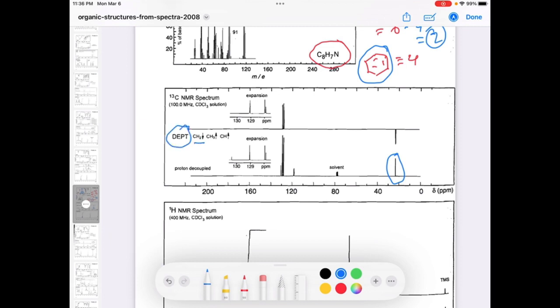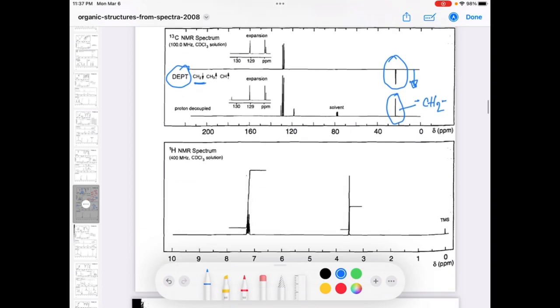In the DEPT, if you see, look at the DEPT. We always know the DEPT always gives you the CH2 carbon downward. See, this carbon is giving downward, so we can say this carbon is CH2 peak, like CH2 carbon. Now, the benzene ring, how is that benzene ring there?